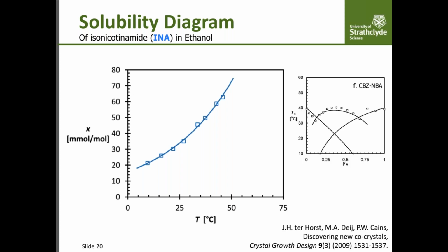I just want to give one example where we screened a co-crystal system. We have 3 components in there: the solvent, a pharmaceutical, and a coformer. By picking typical concentrations of the samples, we can screen the phase diagram and show whether a co-crystal exists or not.